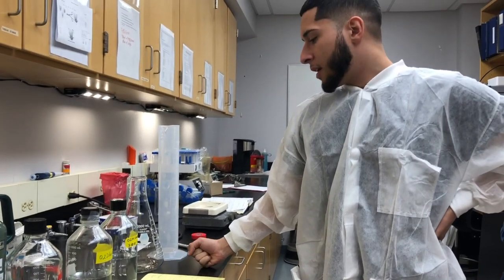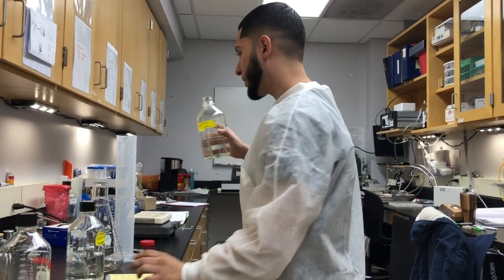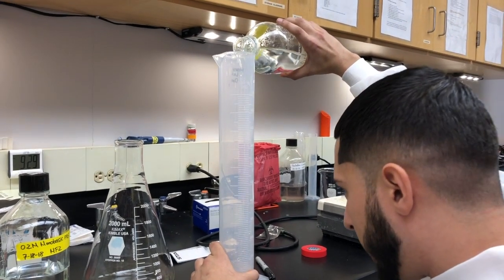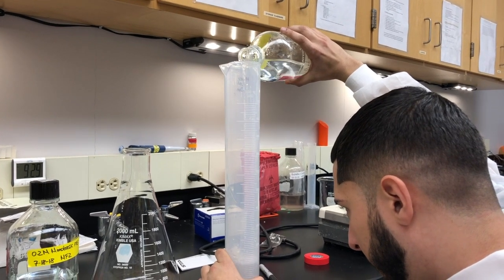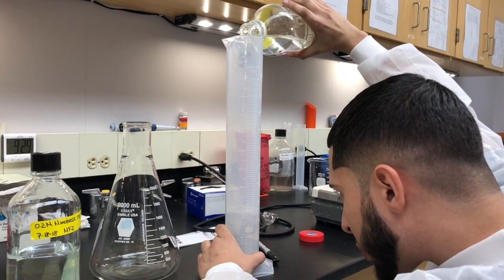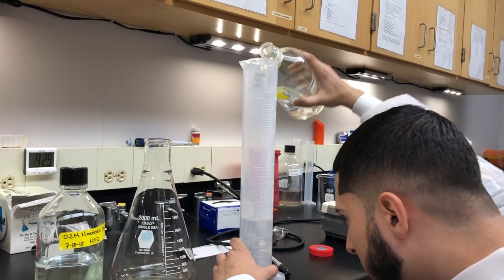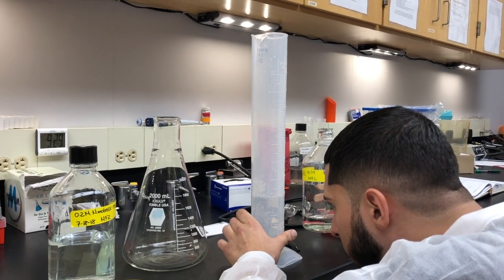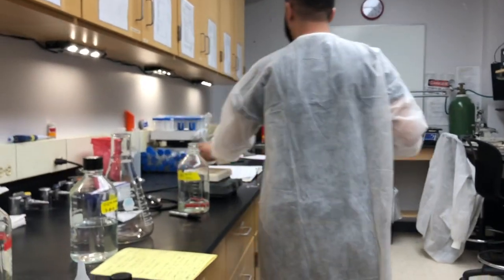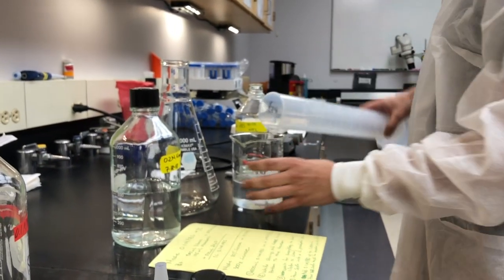So to make one liter of PBS, what we're going to do first is get the dibasic and measure 305 milliliters of it. You want to get eye level with the graduated cylinder so you can see exactly how much you're pouring in. We're going to go for 305 milliliters, then put it in our beaker.